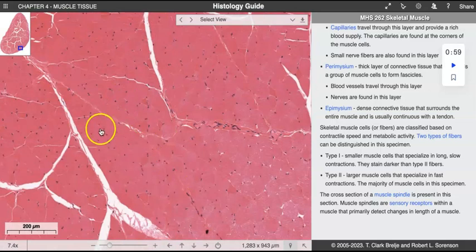Other slides that you can go to, so if you have a slide that doesn't have a lot of connective tissue, you can try to head over to, let's say, a muscle-bone connection slide. You might be able to see some muscle at the periphery of your intervertebral disc, or further outside the trachea, because it's a section of the neck. We will run into skeletal muscle in some other areas, but you should have a slide at least that says skeletal muscle in cross section and longitudinal. And then you're also welcome to look at other slides in the other boxes as well.